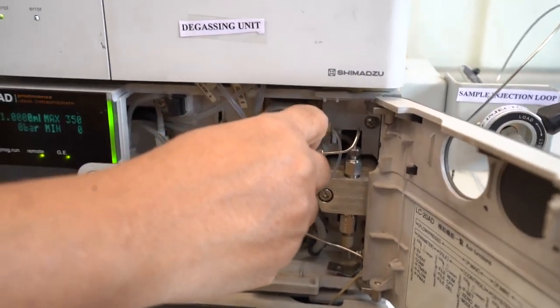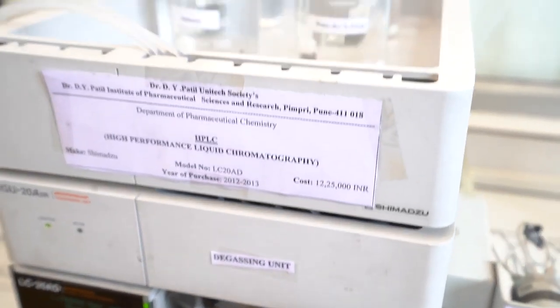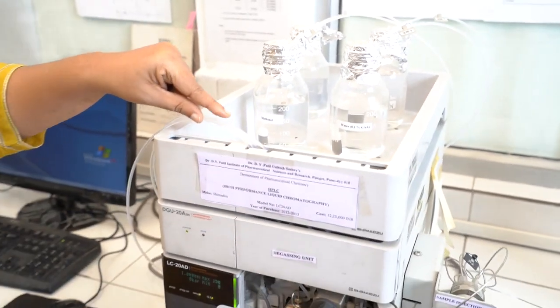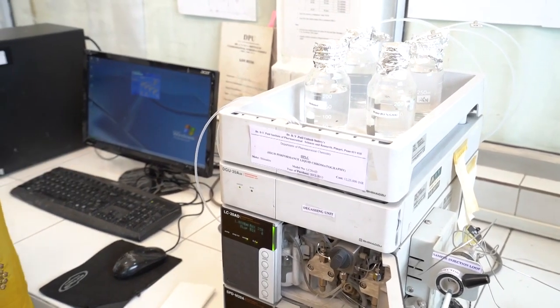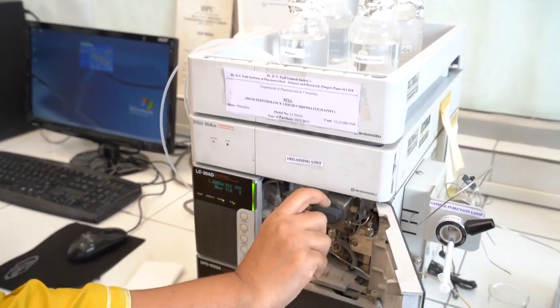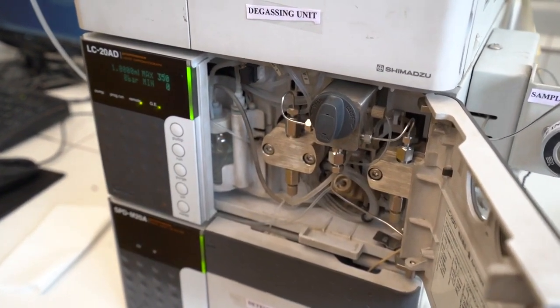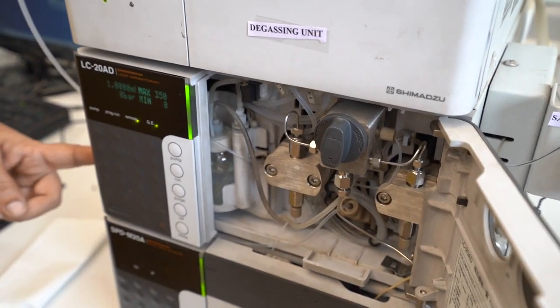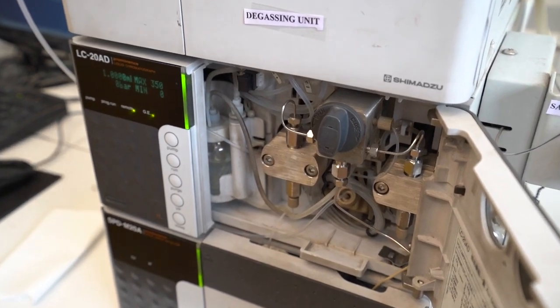When the purge valve is open, the mobile phase is sucked in from the solvent reservoirs and it is flushed through the inlet tubings to remove any dissolved gases that may be entrapped in the tubings when the HPLC system is left unused. Once the purging of the system is carried out, the purge valve needs to be closed and the HPLC operation can be carried out. In case of the Shimadzu system, the purging is carried out for a total period of 3 minutes at a flow rate of 8 ml per minute.